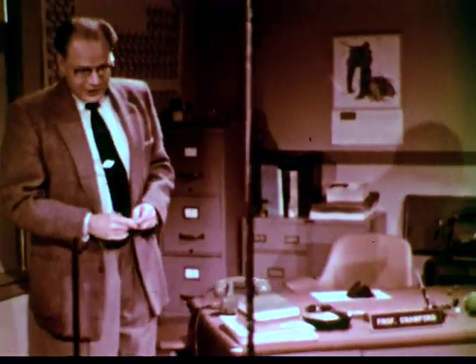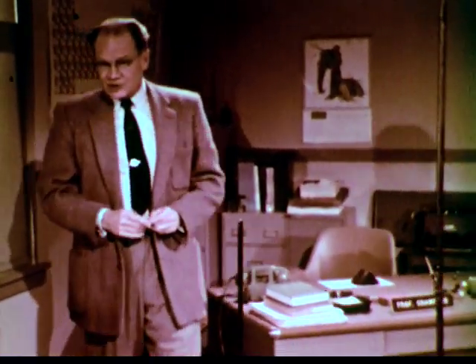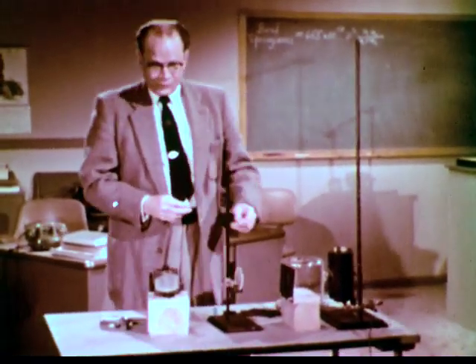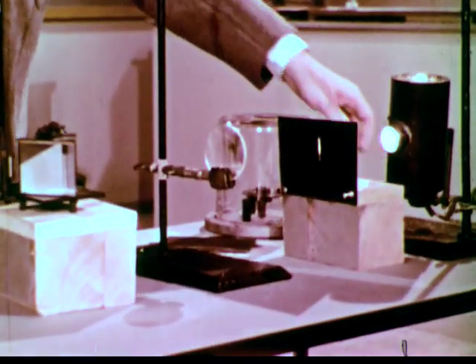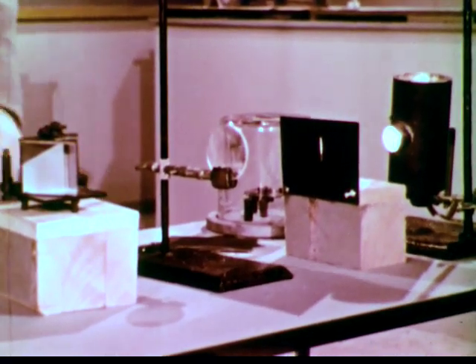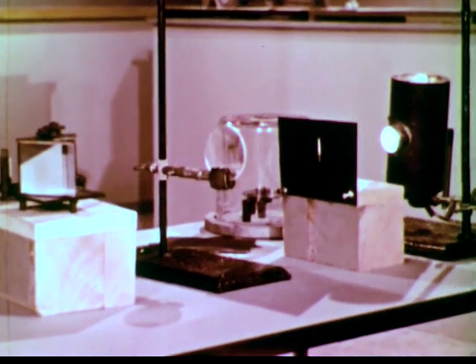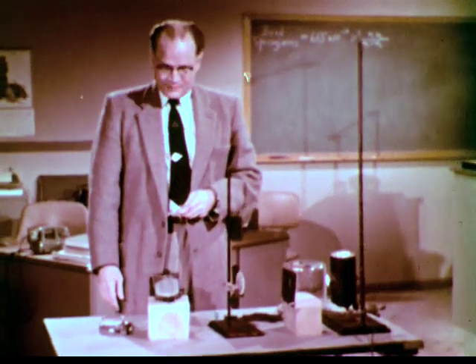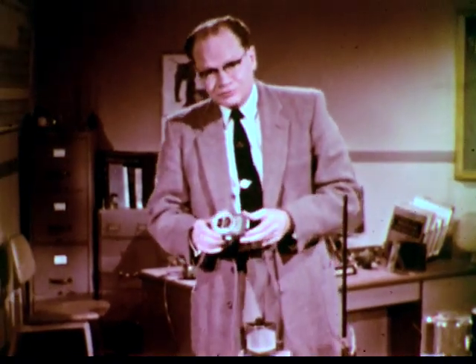At the start of the last century, Herschel set up a spectrum just as Newton had done, except that instead of merely using his eye to examine the colors, he used a detector. To his surprise, the detector showed the presence of radiation even beyond the red end of the visible spectrum. Now, today we have more delicate detectors than Herschel had. We can easily show the presence of infrared radiation using an ordinary exposure meter.